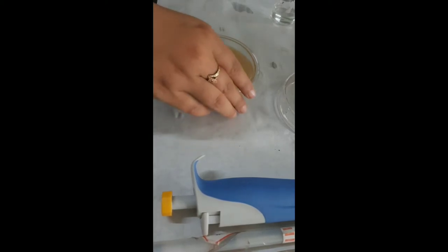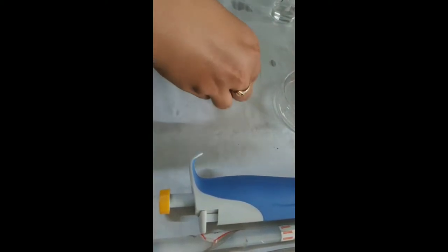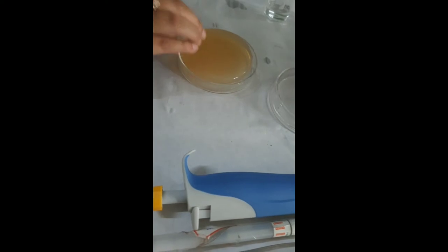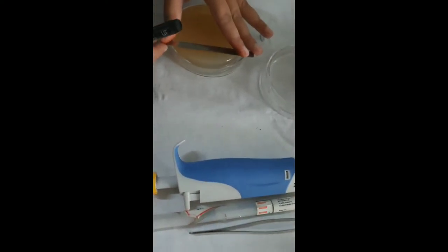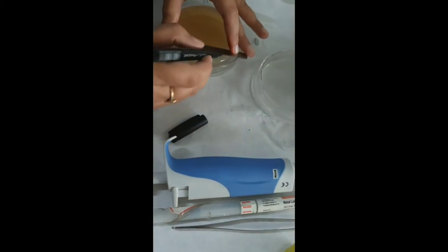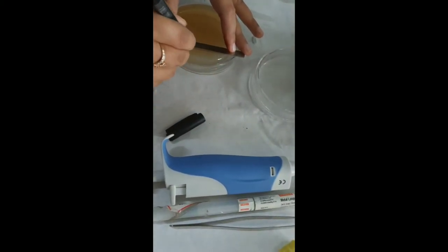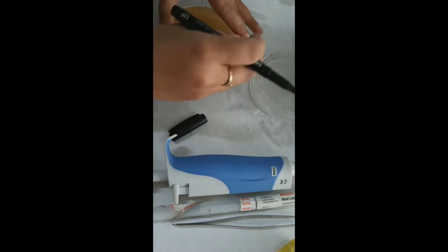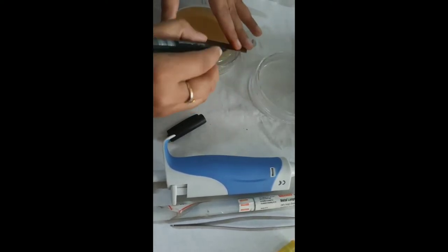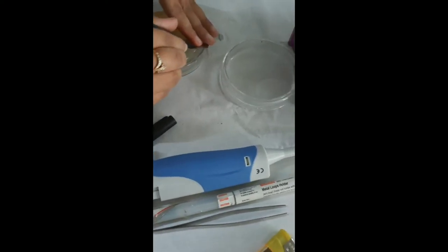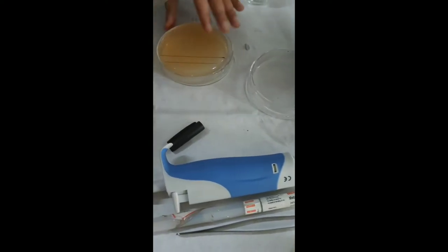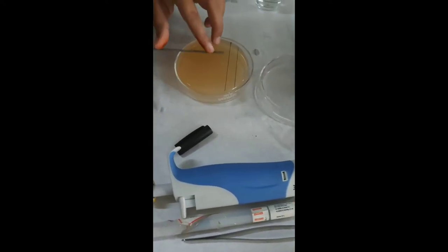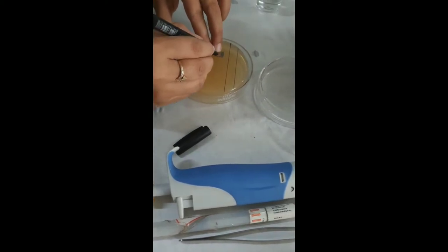First of all, we have to take the agar plate and we have to invert it and mark two parallel lines at the end of the petri plate. Perpendicular to this, we have to draw two lines over here.